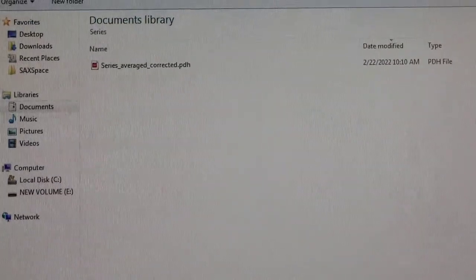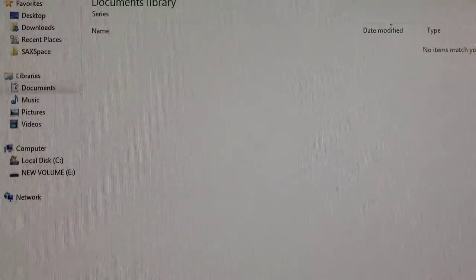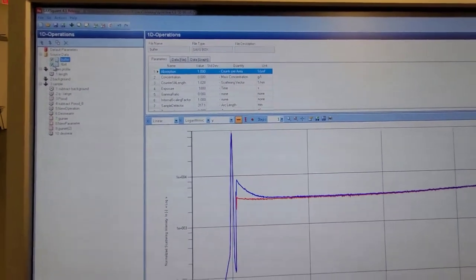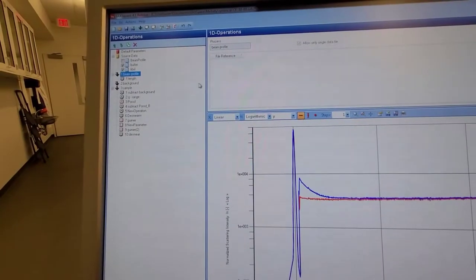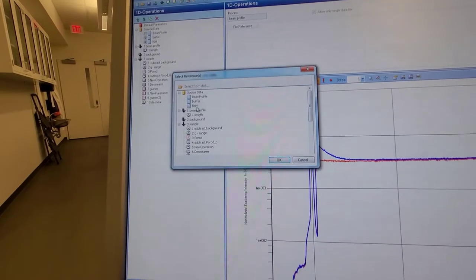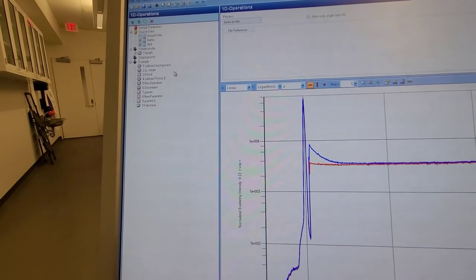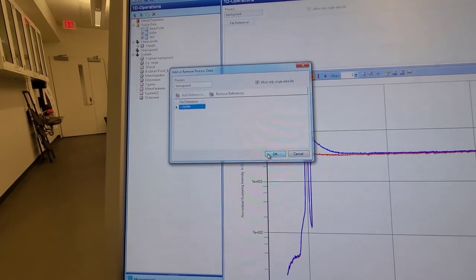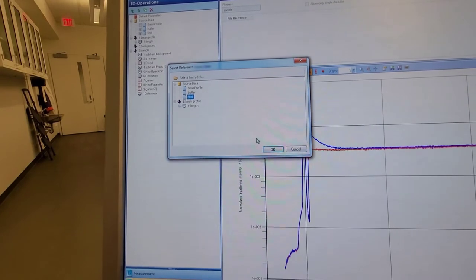Then you also add a beam profile for one of them. I did that for both. You can see them plotted together. The buffer is a flat line and the sample is higher, so this is how it should look like. I also select which file is the beam profile because the software should know that. And you tell it which one is the sample and which one is the buffer. I'm just doing that, telling it which is which.